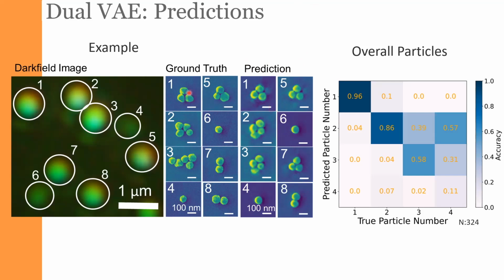So look at this. This is our ground truth 1 and 5. They're both trimers, and the network predicted trimers. This is 2 and 6. One is a tetramer, another is a monomer. The network predicted the monomer remarkably well. The tetramer looks different. Of course, we don't expect to capture these details, and the number of examples for tetramers is exceptionally small anyway.